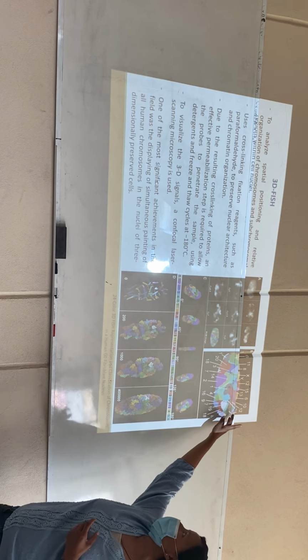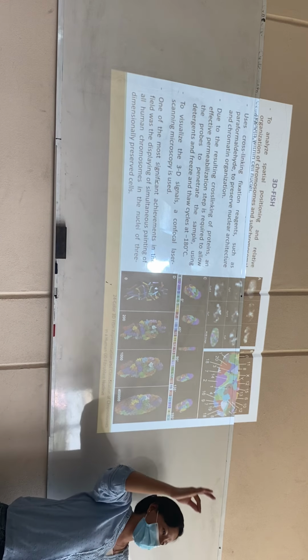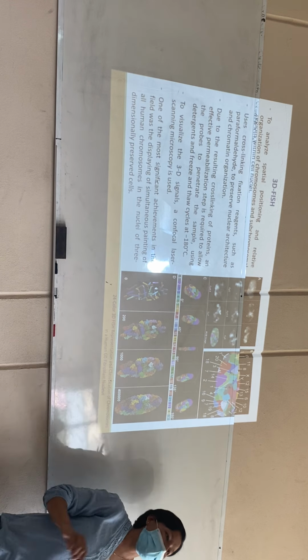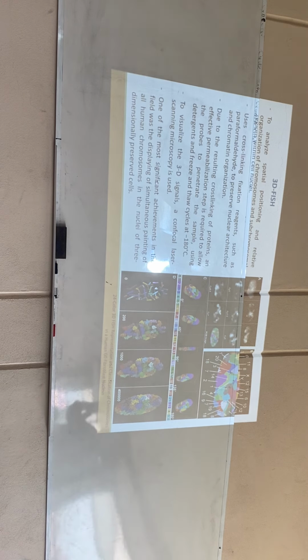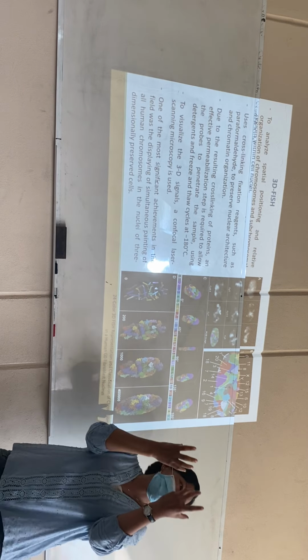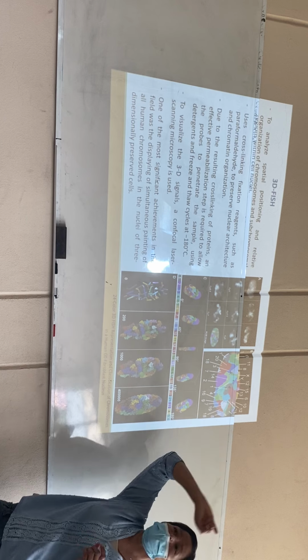So basically what you're observing here is that the chromosomes are not linear, no? They don't have an X shape or a Y shape as we believe. Basically, they are structures with 3 dimensions, but if you see, they look like, I don't know, like clusters, no? Like groups of different things with different colors.